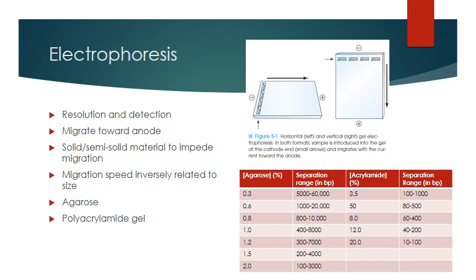So that we know. Wonderful. You can do electrophoresis either in a solution, but when you do it in a semi-solid or solid material like an agarose or a polyacrylamide gel, the migration is going to be limited based on the size of the DNA, and that will be based on the spaces in the gel.